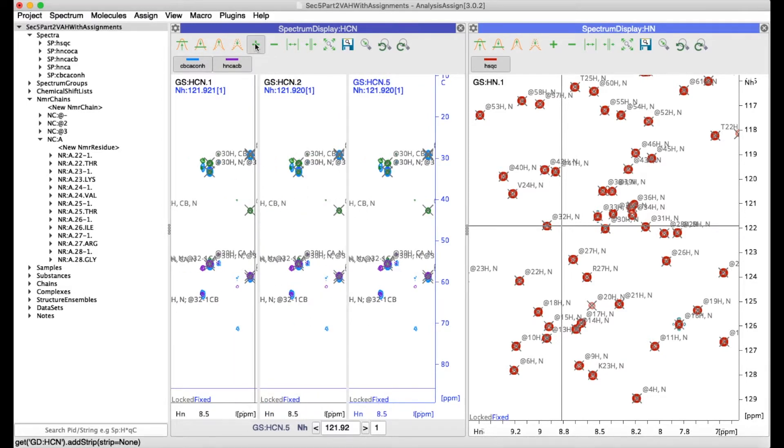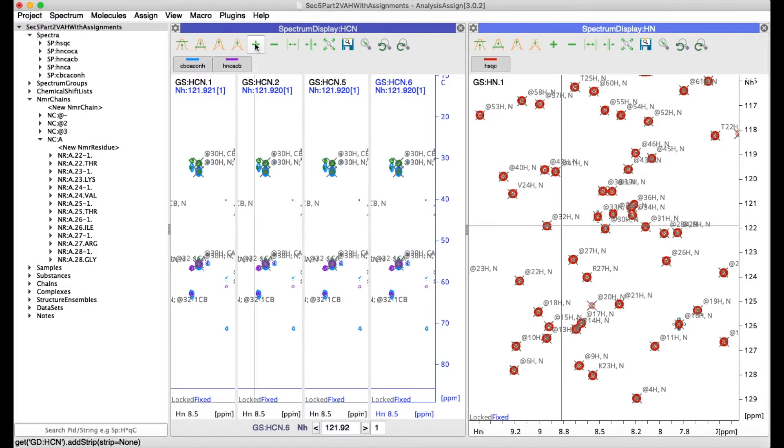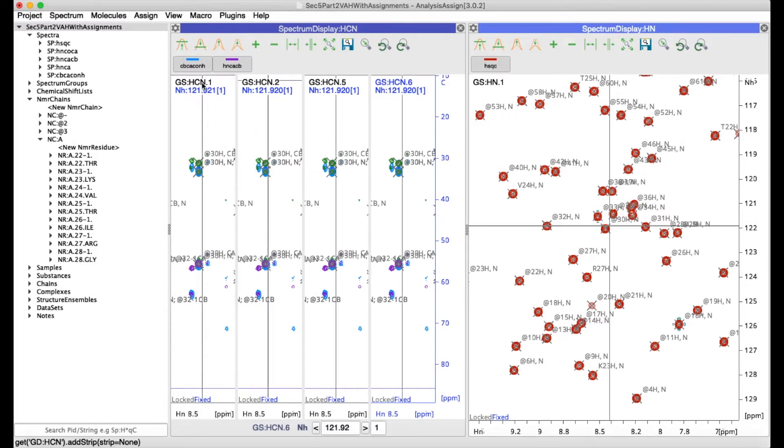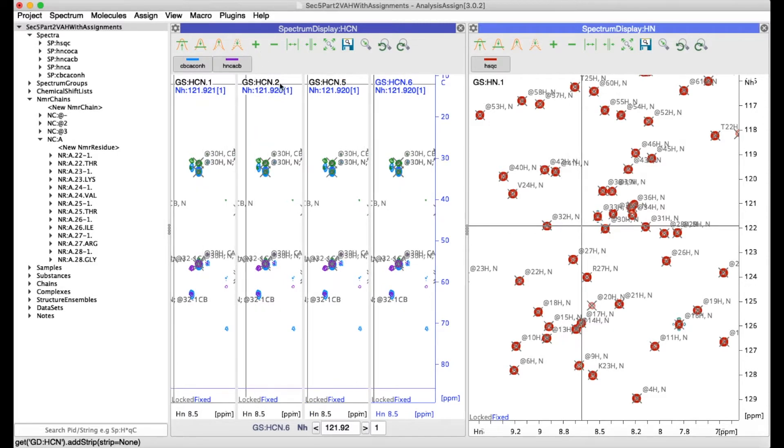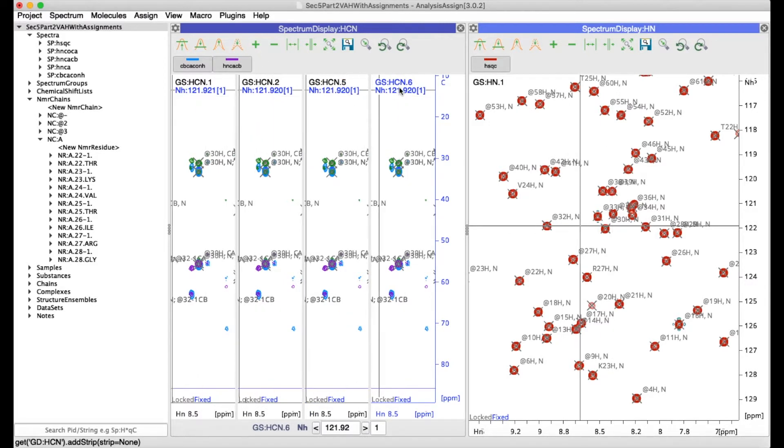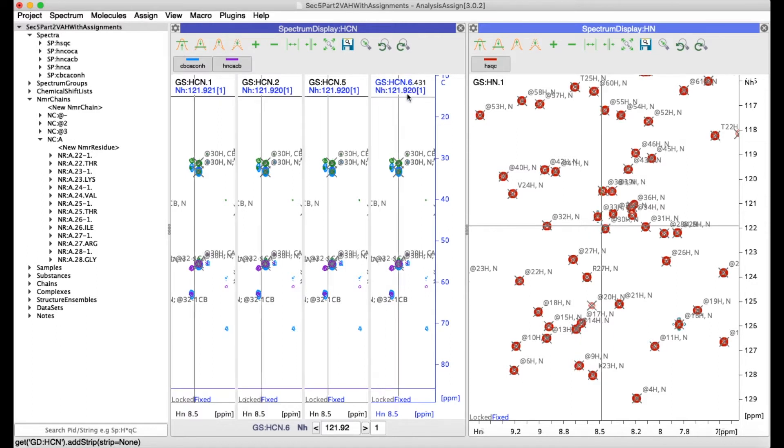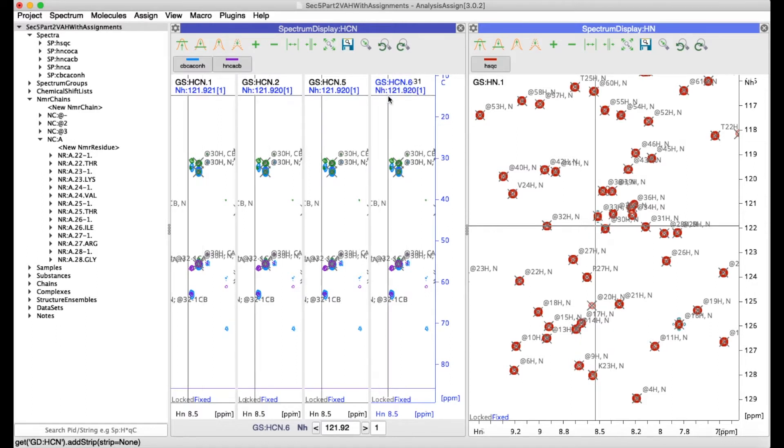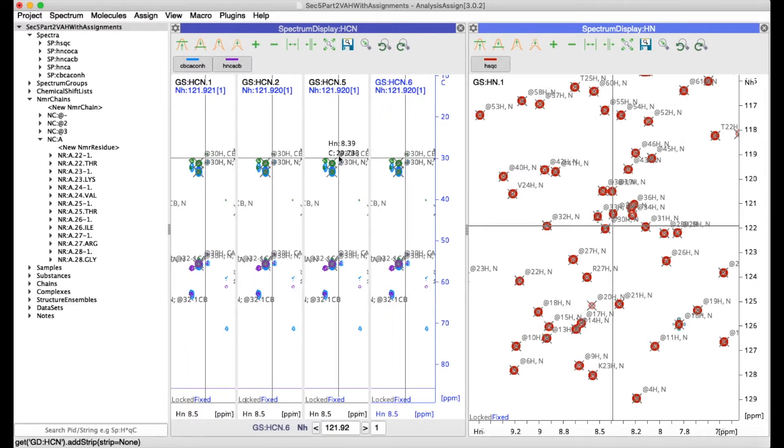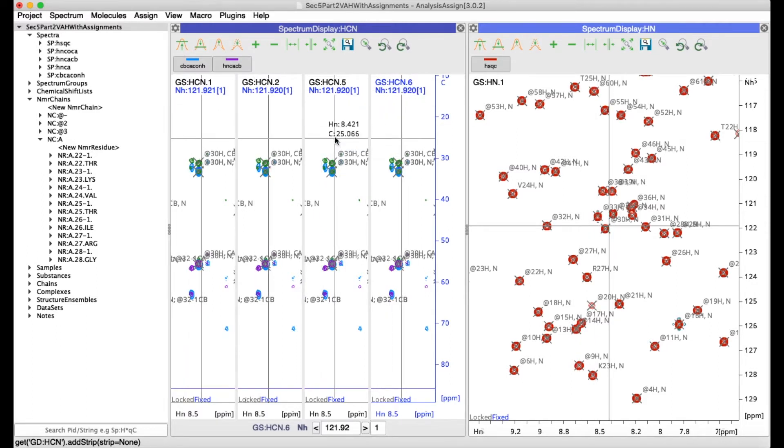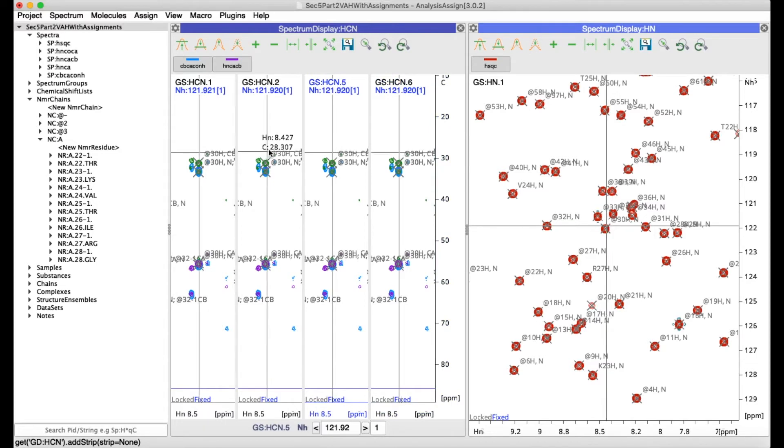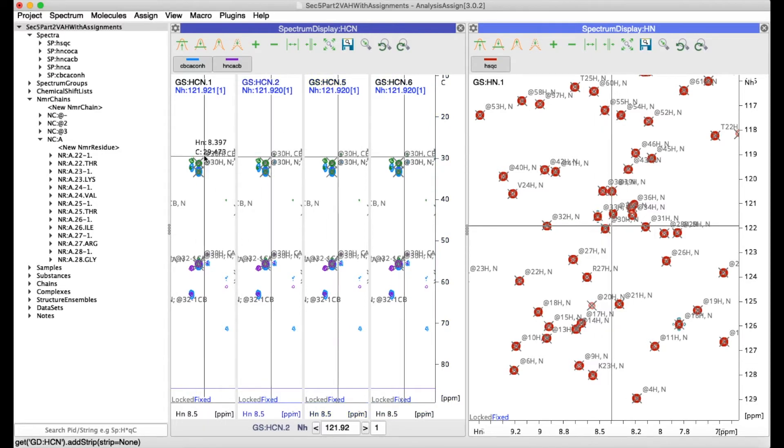Notice that each strip has its own strip ID at the top and the strip ID which is highlighted shows that that is the active strip. You can make a strip active simply by clicking in it.